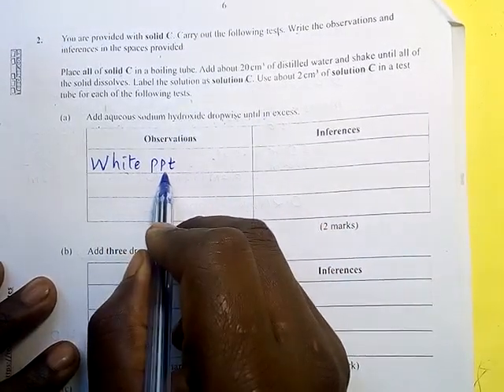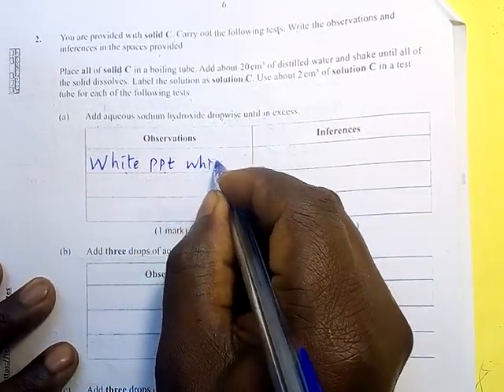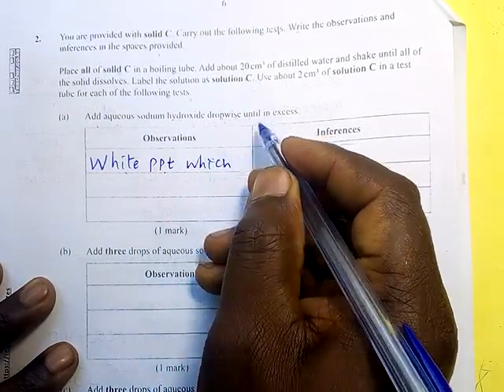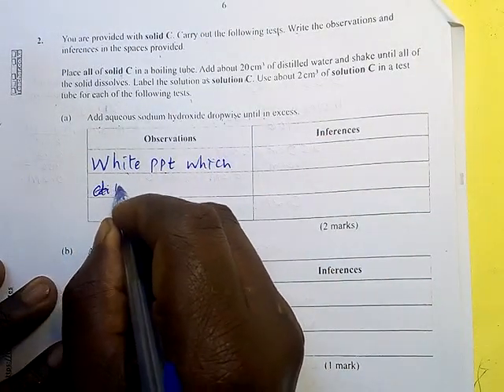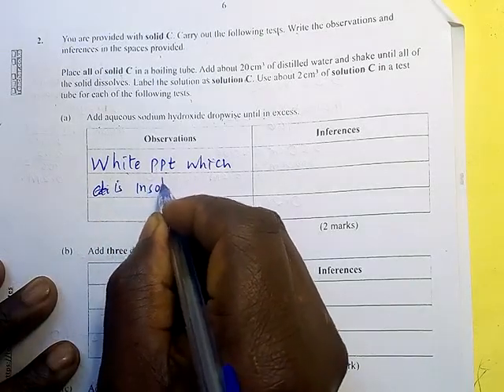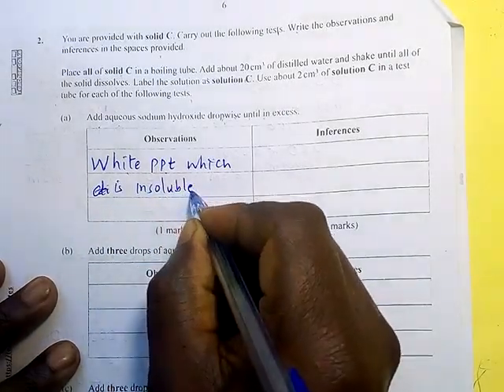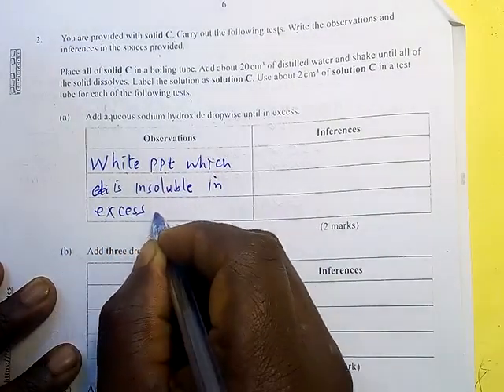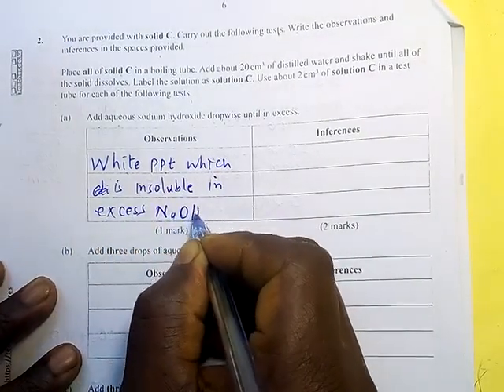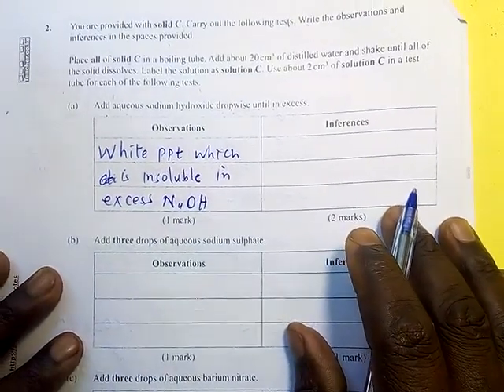The white precipitate is insoluble, it does not dissolve in excess sodium hydroxide. So this is the expectation.